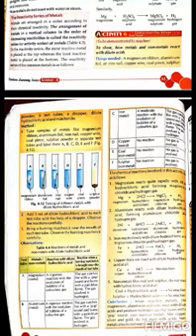Observe the reactions carefully. Bring a burning matchstick near the mouth of each test tube and observe what happens.